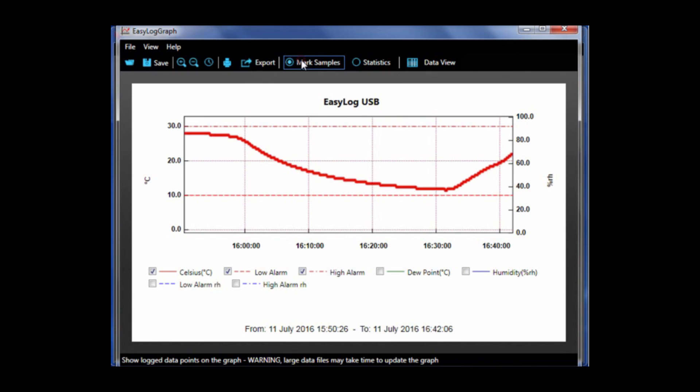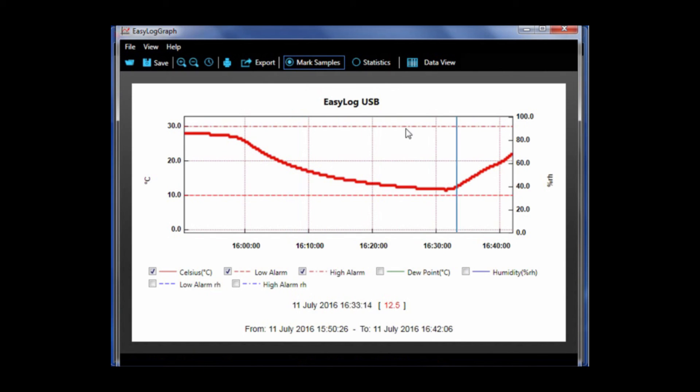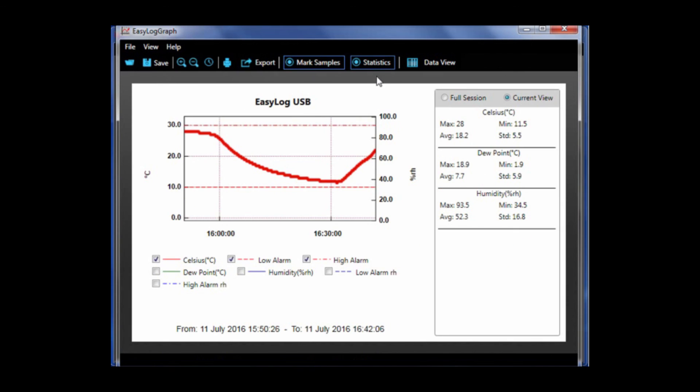There is a marked samples option which shows log data points on a graph. There is a statistics option which shows the max, min, average, and standard deviation based on a normal distribution for all of the traces.